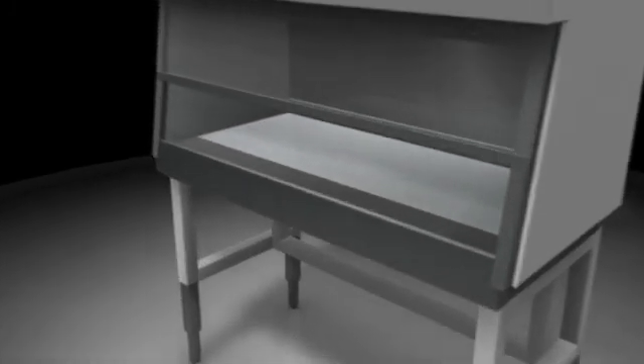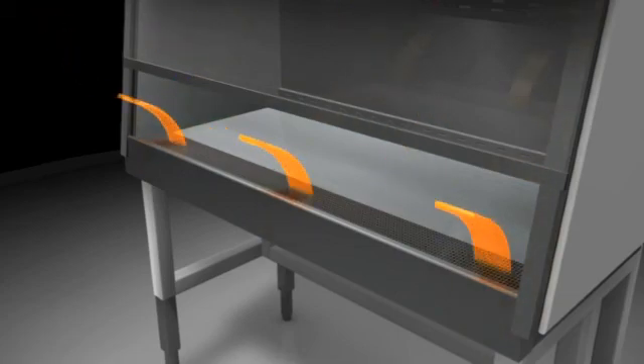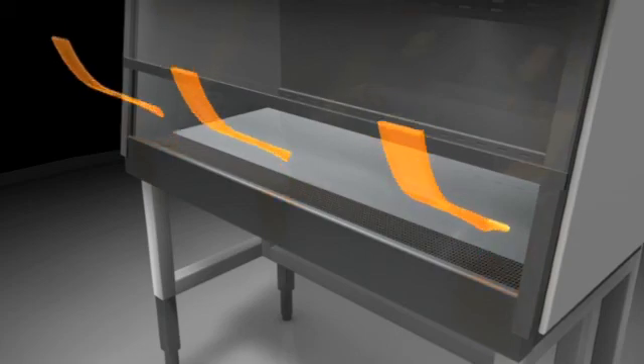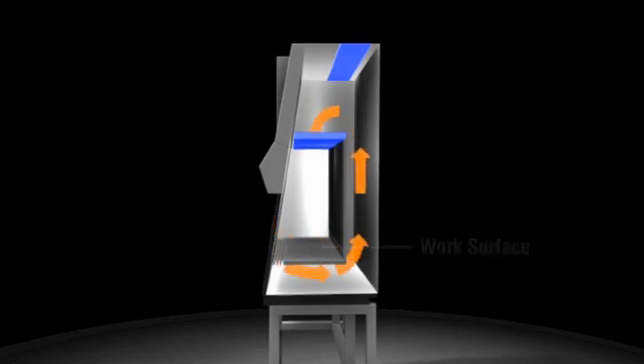Air from the room is drawn into the cabinet through the access opening and down into the front grills. This ensures that air from the cabinet does not escape into the laboratory, and because the air from the room goes directly into the front grills, it doesn't contaminate the product in the cabinet. The air that enters through the front grills joins the air that has flowed over the work surface.